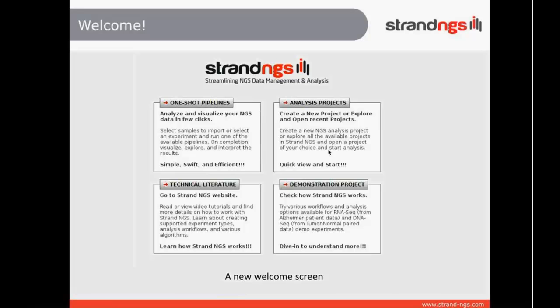Whenever you close an experiment, you're going to see the screen. Whenever you start the tool, you're going to see the screen. We're going to go over this welcome screen later on. For now, hopefully, it signifies the general changes in Strand NGS 3.0 as well.